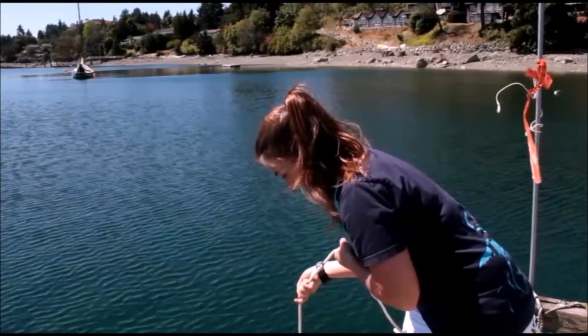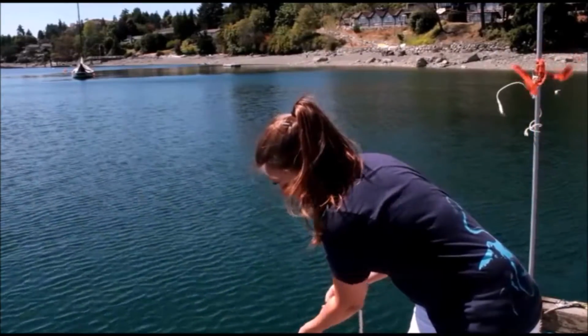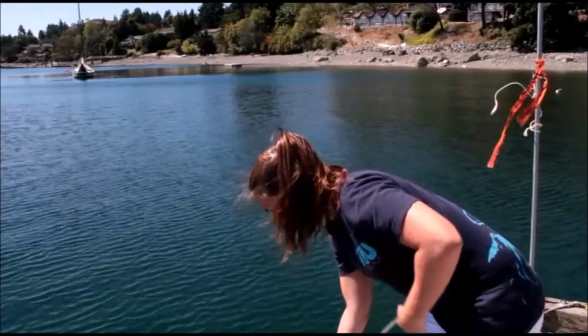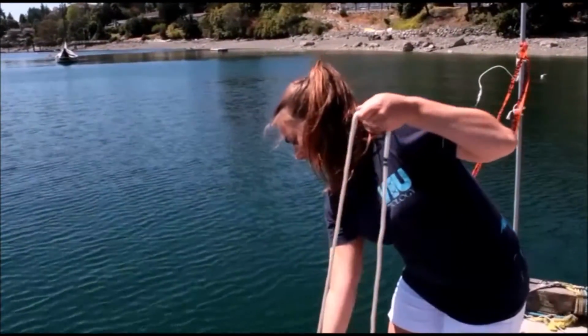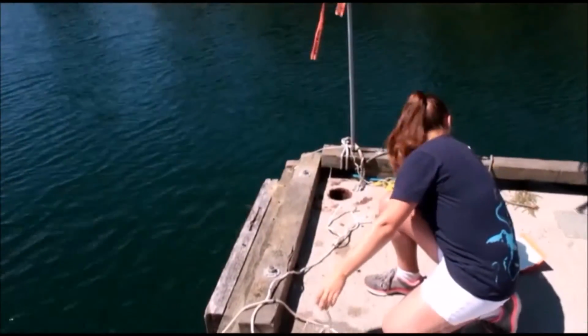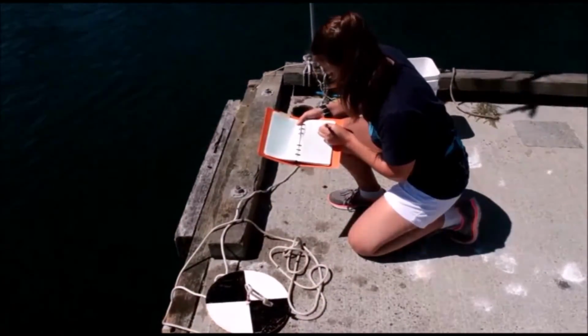And then you note what depth that is before bringing it back up. And you note your Secchi depth, and your sampling is done.